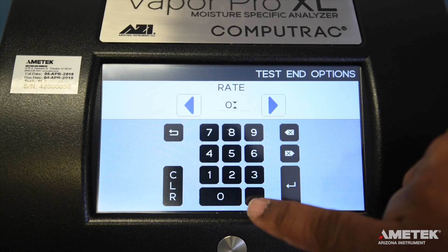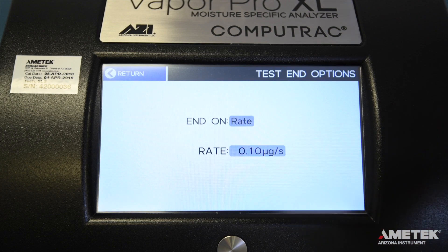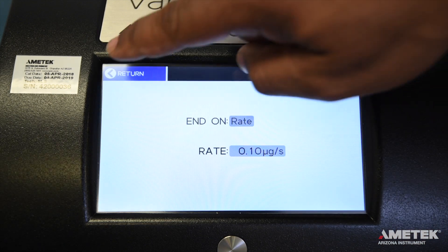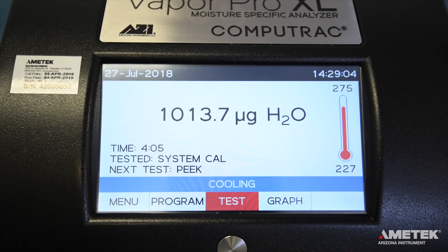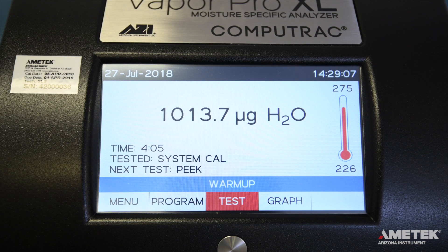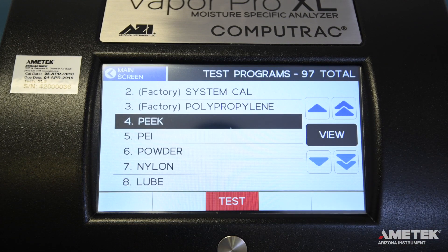Now that all your parameters are set and saved, return to the home screen by touching the silver home button below the touch screen. You have now added a new program to your CompuTrack Vapor Pro XL and can find it in the program list by selecting Program. With your program in place, you are ready to run a test.